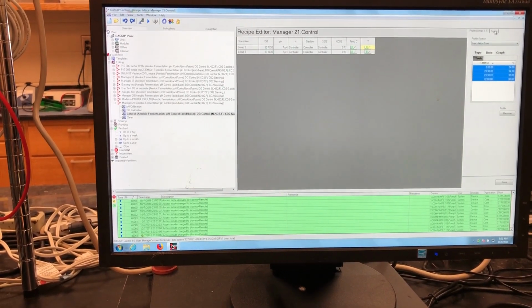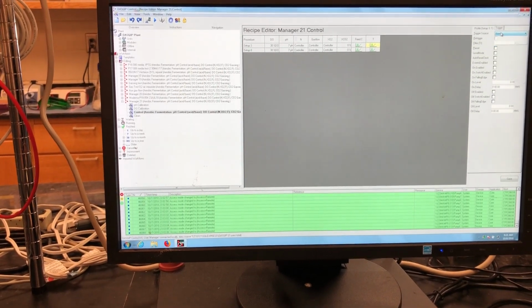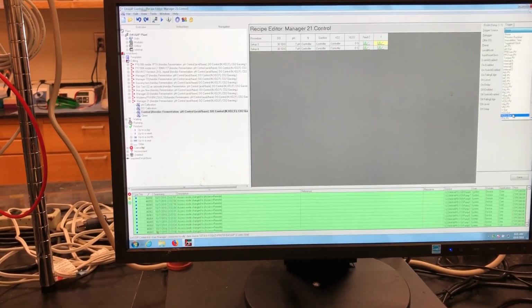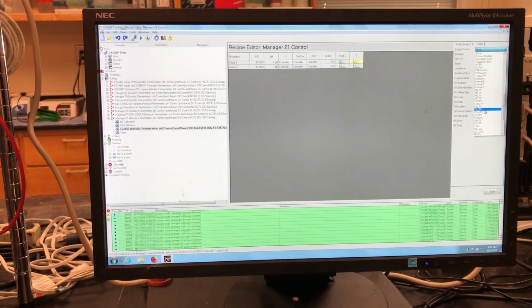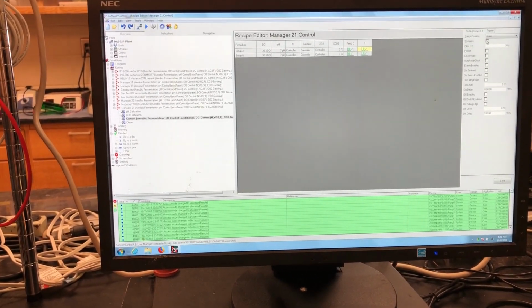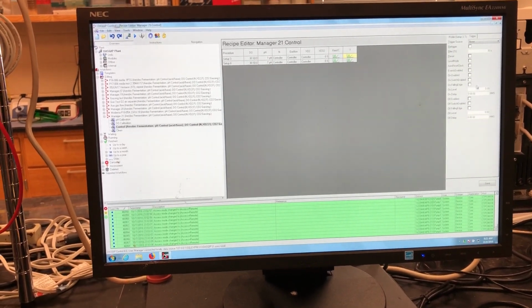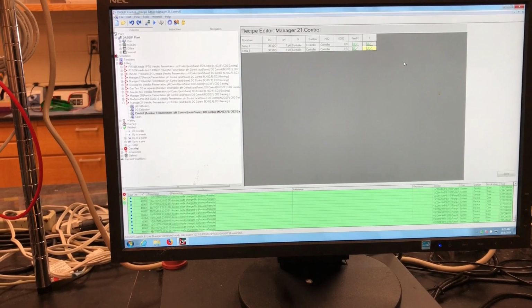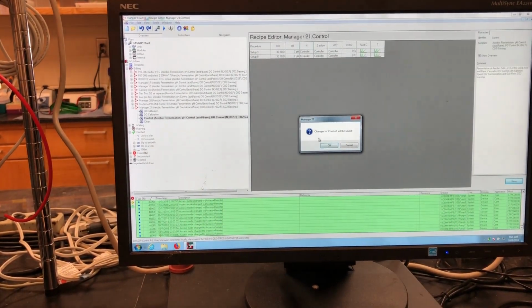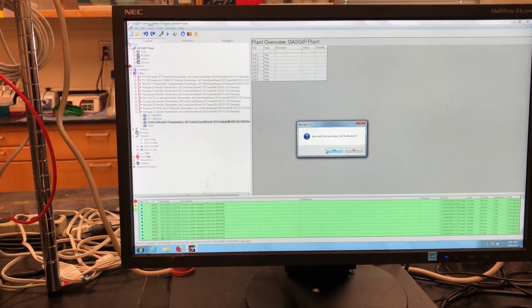To 72. You can, on each of these things, you can select where it says trigger here, and you can tell it to trigger based off of different things. Okay. You can set that based off of time, you can set that based off of a number of different variables. Right. And you can set different parameters based around it triggering. You can set it so that it can trigger multiple times, and a number of different parameters for that. All right. But in this case, everything seems good, so we will go ahead and save that over here, and then we will continue on to the next screen.